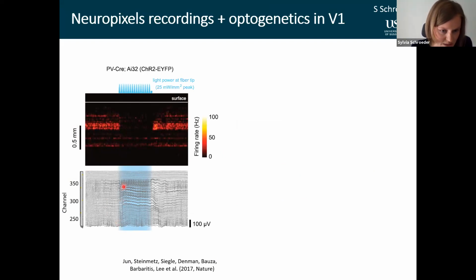And here you can see the effects on the LFP. So these raised cosines leave a funny cosine pattern in the LFP. So probably you cannot easily use this LFP if you're interested in this.